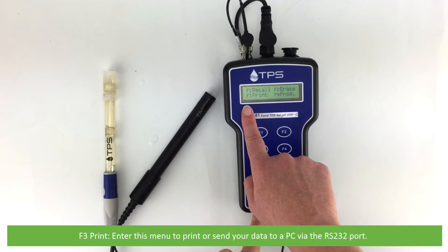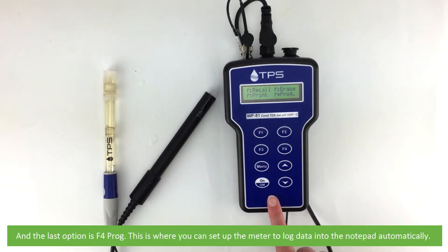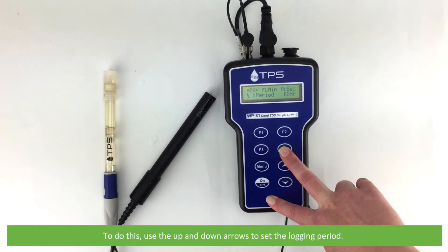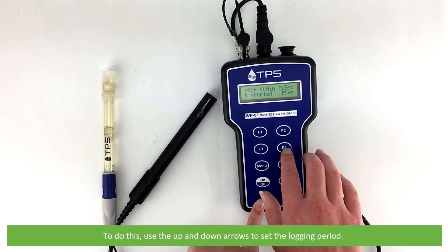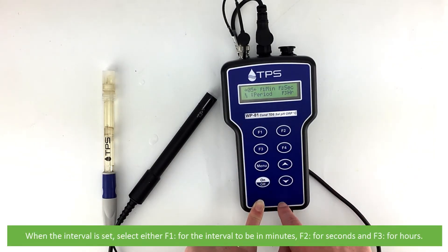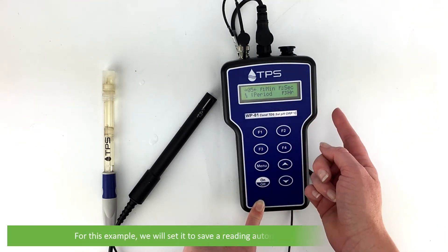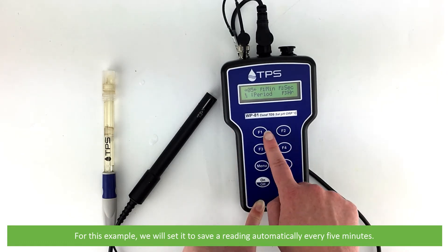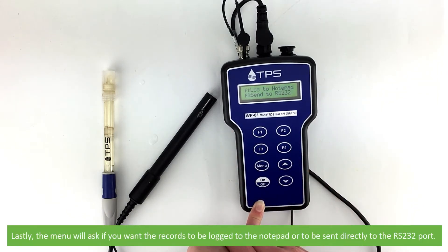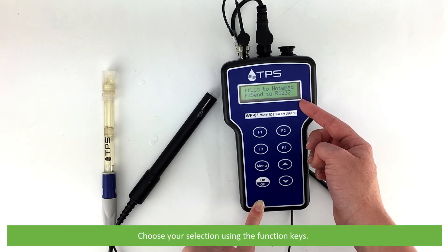F3 print — enter this menu to print or send your data to a PC via the RS232 port. The last option is F4 program. This is where you can set up the meter to log data into the notepad automatically. Use the up and down arrows to set the logging period. When the interval is set, press F1 for the interval to be in minutes, F2 for seconds, or F3 for hours. For this example, we'll set it to save a reading automatically every five minutes. Lastly, the menu will ask if you want the records to be logged in the notepad or sent directly to the RS232 port. Choose your selection using the function keys.